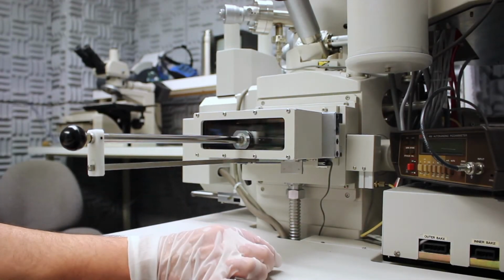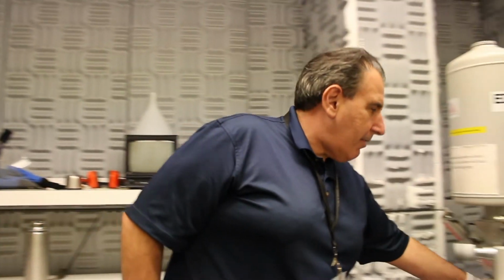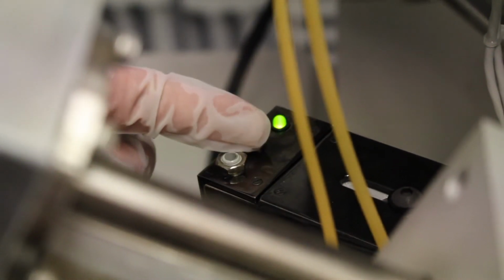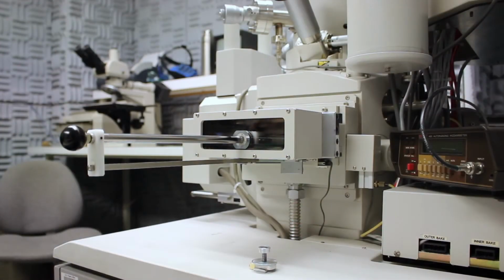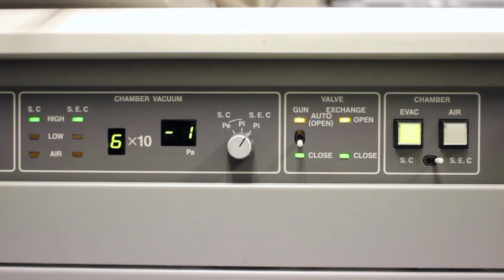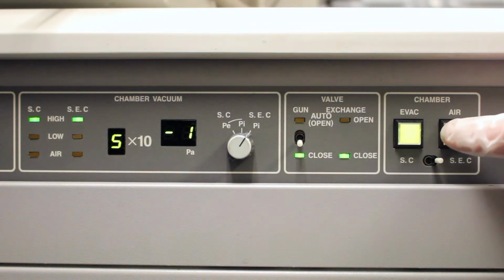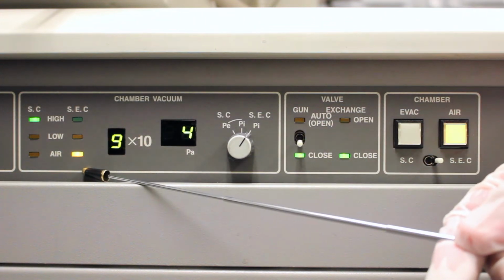Loading the sample holder into the chamber. First turn on the chamber view camera and monitor. Okay, we're now ready to turn on the camera, monitor, the switch back here, and of course the monitor itself. Then vent the specimen exchange chamber. To vent the specimen exchange chamber, simply hit the air button, and it will take a few seconds for it to get to atmosphere.